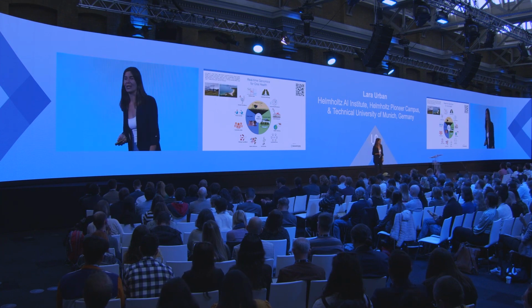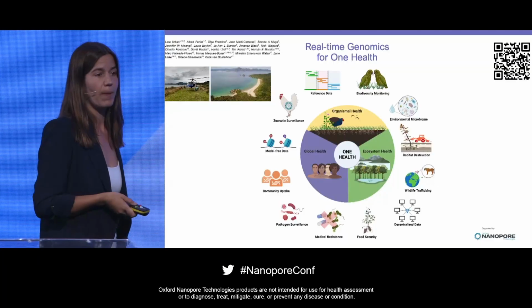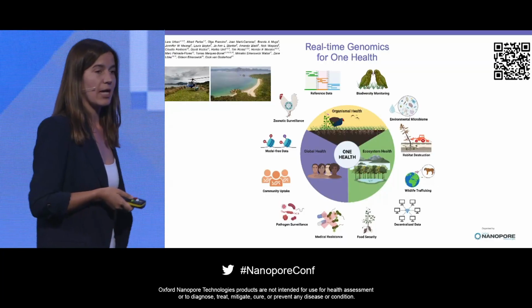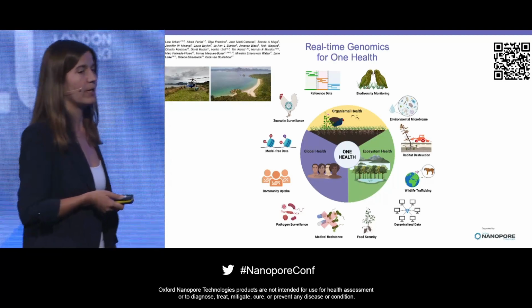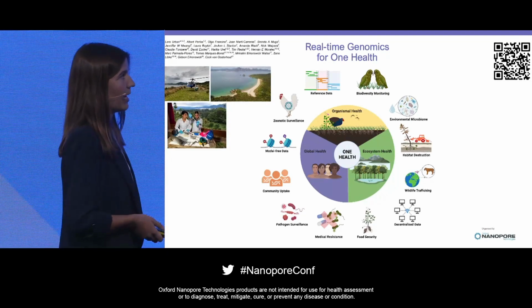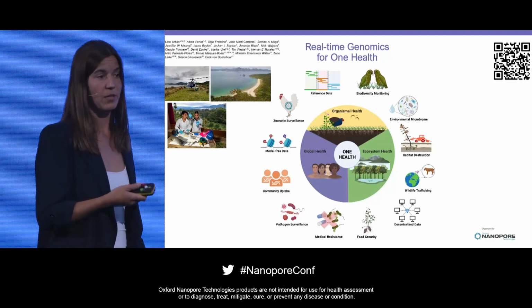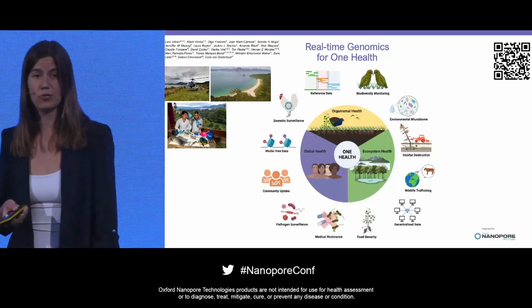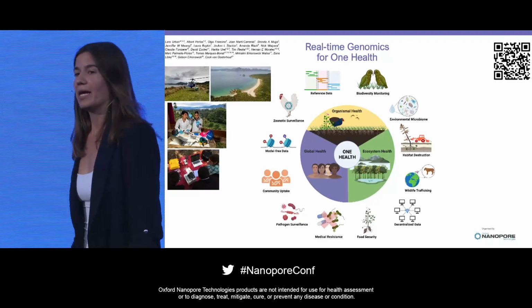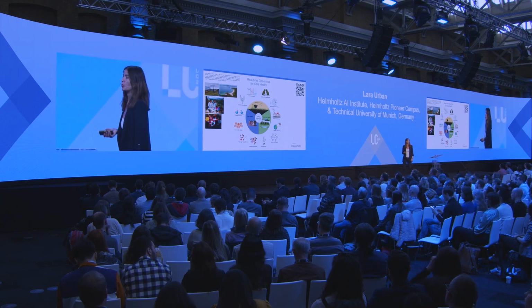Now, we obviously also mention a few of our own research examples in this perspective, ranging from applying nanopore sequencing on remote islands in New Zealand, work from my postdoc where we monitor the spread of pathogens in critically endangered wildlife, to the application for biodiversity monitoring directly in biodiversity-rich areas, such as in the middle of Ecuador, a project set up by the In Situ Lab Initiative, to applications on farms where our collaborators used it to monitor the spread of cassava virus across cassava plants and actually contribute to food security.